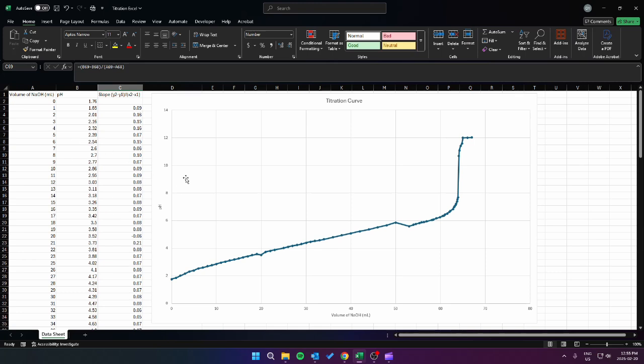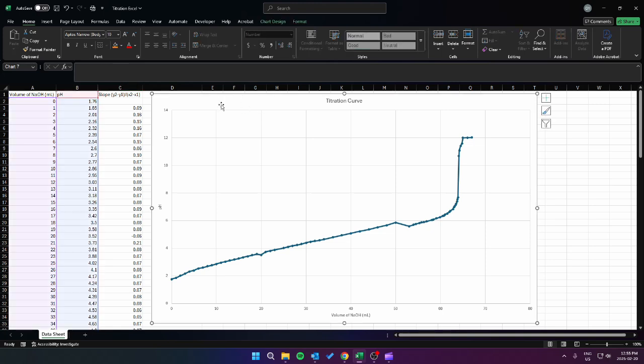So what we want to do is, let's say, add another curve over top of our graph. So we're going to click on our graph, and you can see that Excel is going to highlight in blue where the data is being pulled from to create this graph. And so what we want to tell Excel is, hey, we've got some more data for you to add to this graph. And the way we're going to do this is we've got this blue column here.